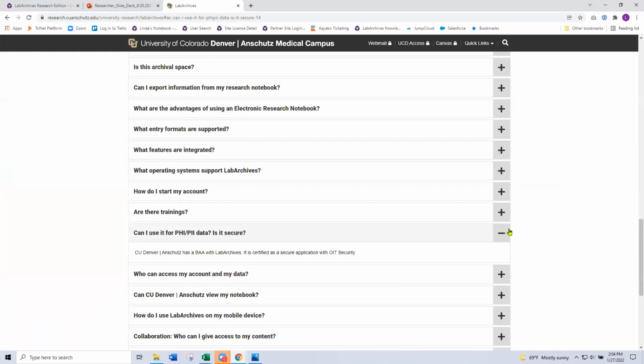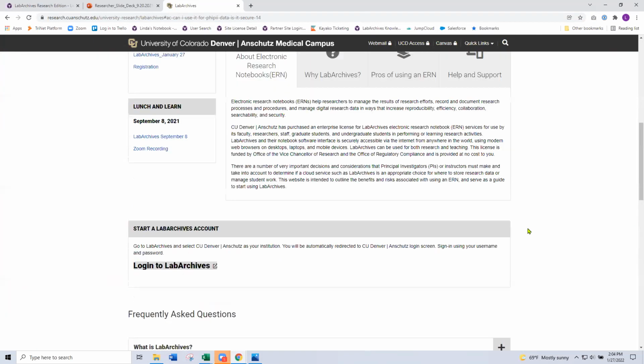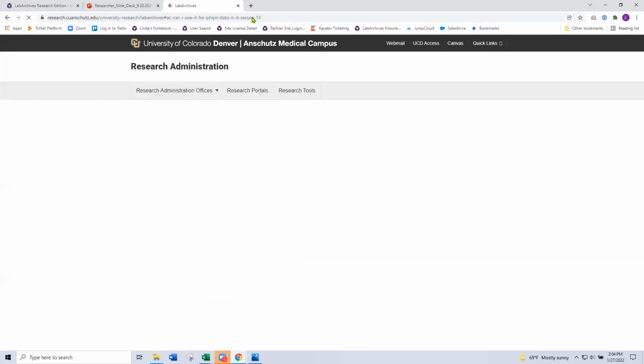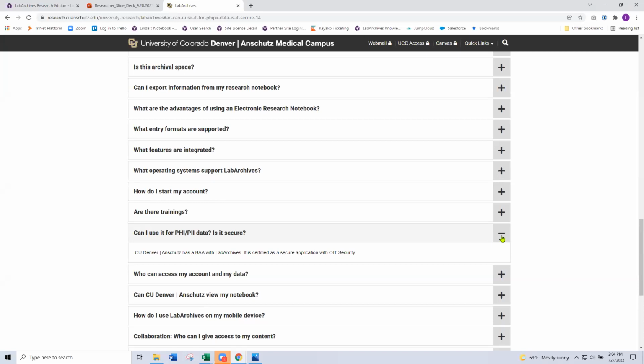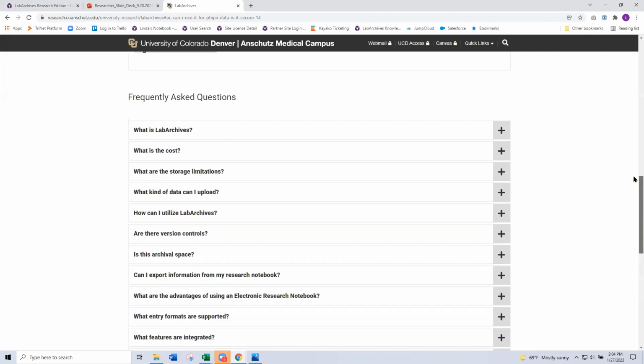Oh, bear with me here. I'll minimize that. It should give us a clean URL. Yeah, maybe not, but I'll be able to get to that here. I think if I close this, it may do it for me.